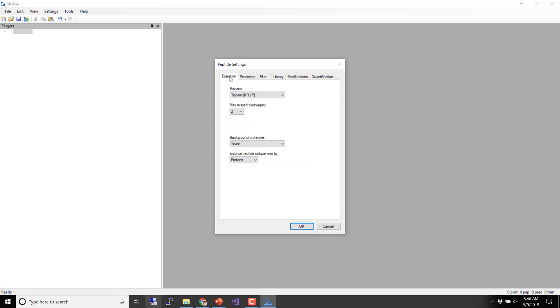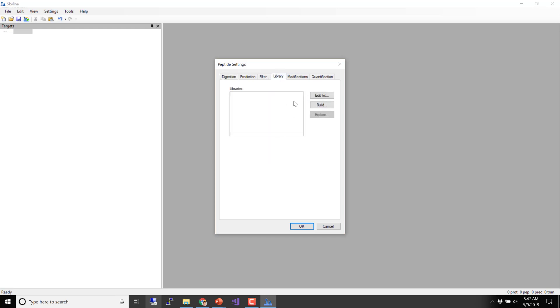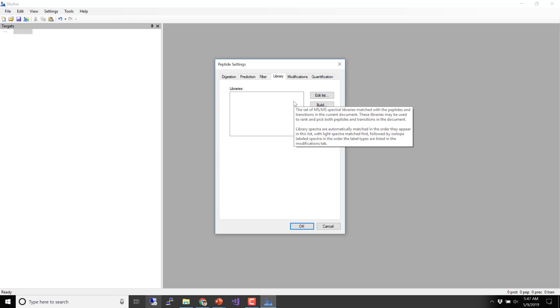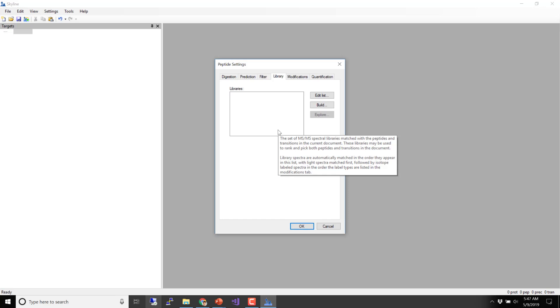We can also choose semi-tryptic cleavage if we have search results that contain those. The important thing to remember is the smaller the set of things you look for, the better you'll get. If you start looking for lots of things — miscleavages, semi-tryptic — you'll lose sensitivity at regular tryptic peptides. We're going to be limited by the library anyway, limited by what we can see with DDA, and we didn't even do any fractionation. Let's build our library and get a sense of what we can find.